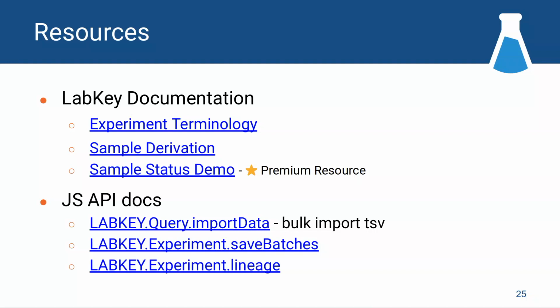Yeah, whether the lineage will be completely recreated if you have the input and output samples. I know that during the bulk import of the TSV, we try to preserve that lineage as much as possible. So for example, if you're updating a row and you're pruning a parent, you say, I screwed up, that's only derived from one sample, not two samples. We'll remove that sample from that lineage and create a new run. So kind of, because that other sample may have been used elsewhere, right?